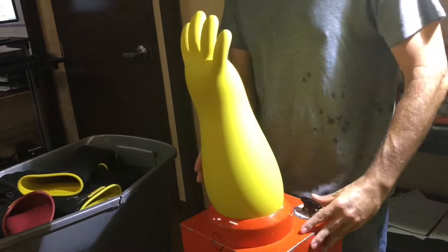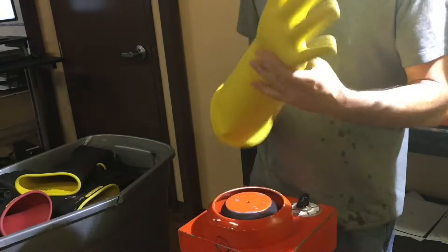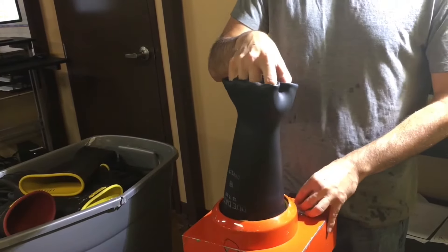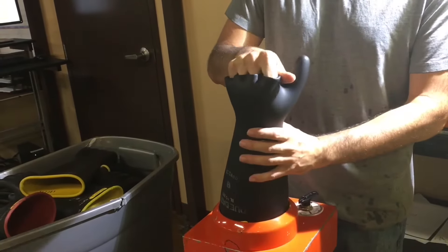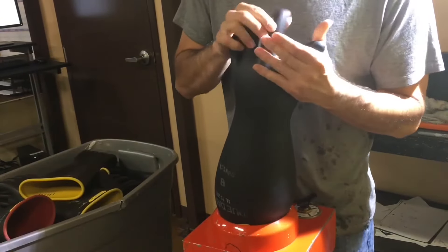Extra bright lighting is located at this station to ensure that no defects are missed. Our technicians inspect the entire surface area inside and out, paying special attention to the palms and fingers. All types of mechanical damage are caught at this stage, even those that pass dielectric testing.